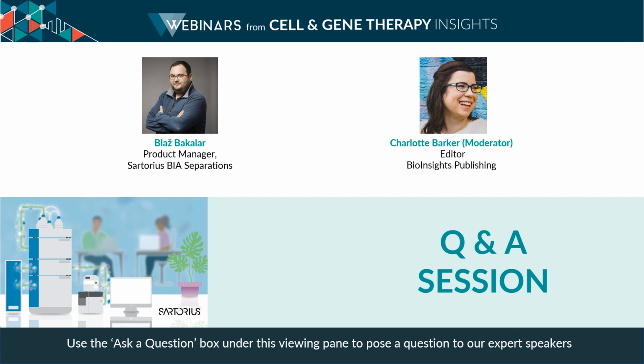Next question. Why are there two peaks for the mRNA in the chromatography? Does it correspond to secondary structure? And how would you check for abortive transcripts? Yes, that's actually a very good observation. So with our analytical method, we actually see two peaks for mRNA. What they correspond to is unstructured mRNA and structured mRNA.